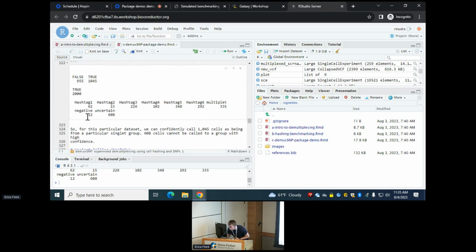So we've 608, I believe, uncertain cells. The cells in hashtag 1, 2, 3, 4, 5, 6, we're quite confident they're being assigned correctly. And now we have this uncertain group.